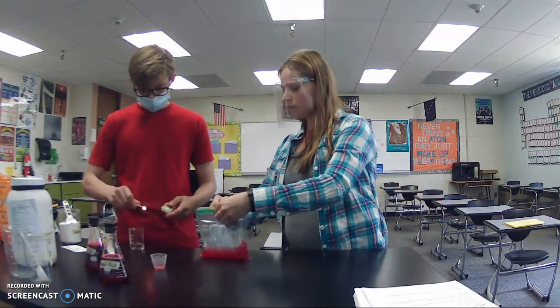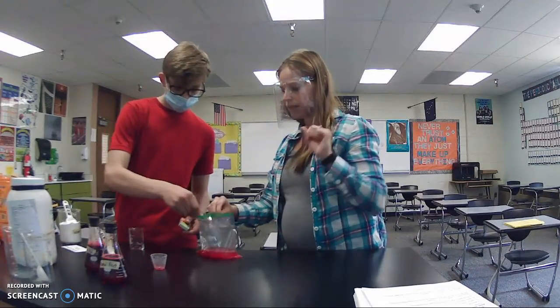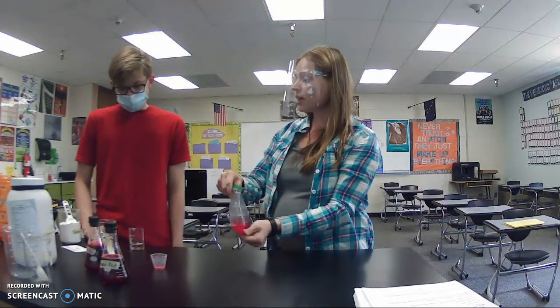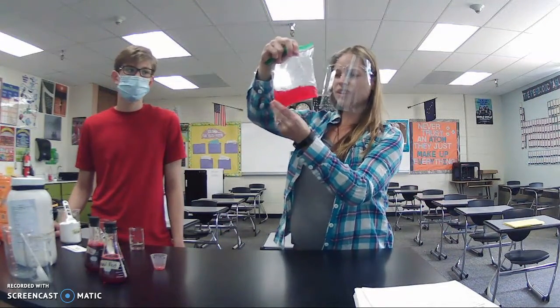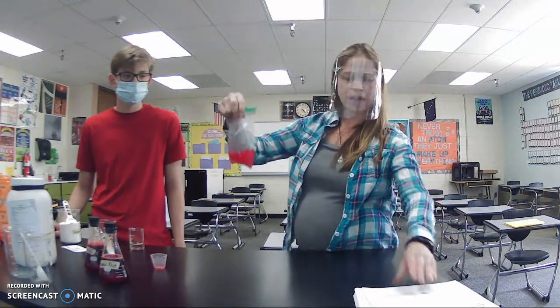Okay. All right, that's long enough. So that was another negative test. It did not put the flame out. Last step. So again, we had heat. There really was no color change. Do you think there was a color change? No. Not to my eyes.